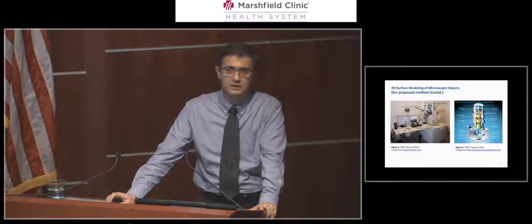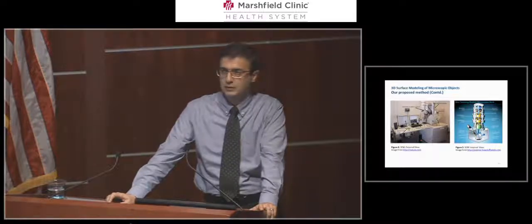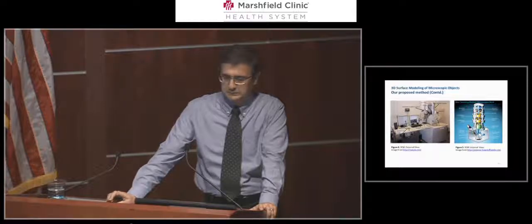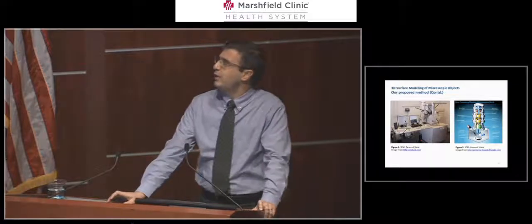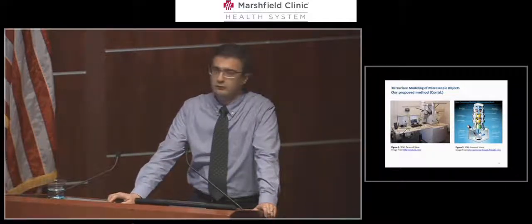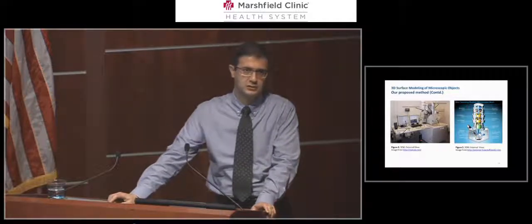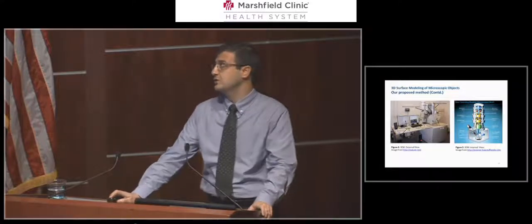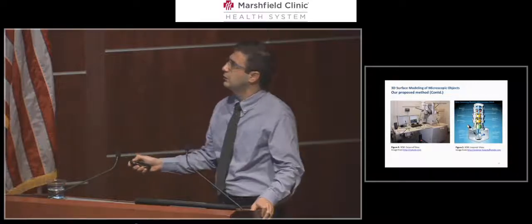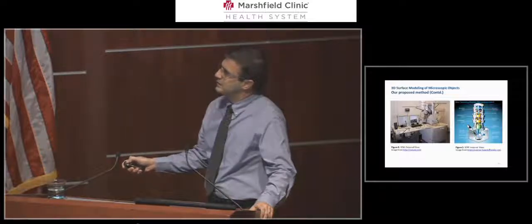So the first step, we need to take several 2D images from a scanning electron microscope. Scanning electron microscope offers excellent capabilities to overcome the limitation of human eyes by achieving increased magnification, contrast, and resolution greater than 1 nanometer. There are 5 major components in a SEM, including electron gun, scanning system, lens control, detectors, and display system.